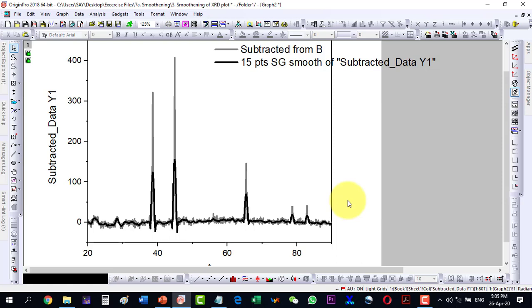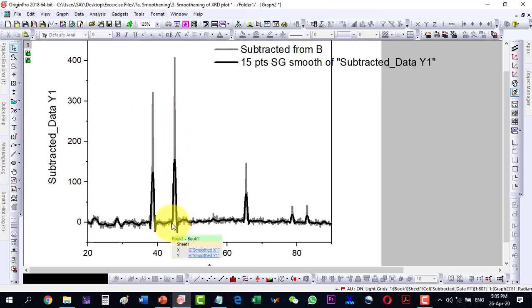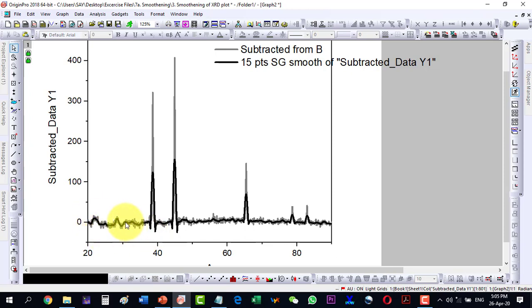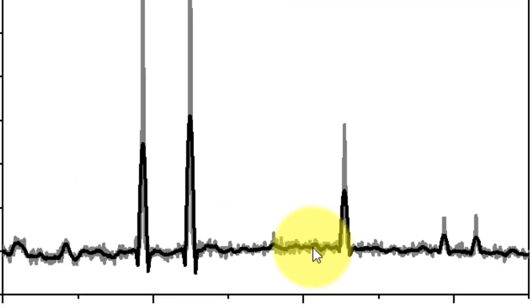So now this way I can show that this is the actual XRD plot and this one is the smoothened plot. So these peaks are of interest while the noise over here, it has been removed from it. So this way I can smooth an XRD plot.